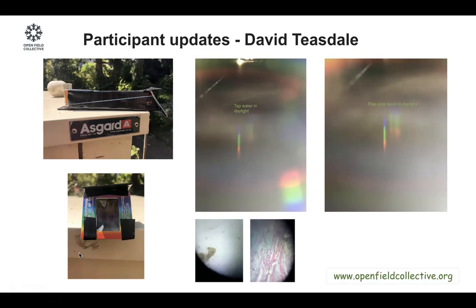That's a great question. If you have a sample that has a lot of leafy green structures, then I would recommend filtering them once, because they will block light, and we are trying to detect algal bloom caused by algae that is primarily microscopic rather than leafy structure. Leafy structures are great for microscopy, so you can image them. But if you end up having a lot of large chunks of leafy structure in the cuvette, that will block light in some way.